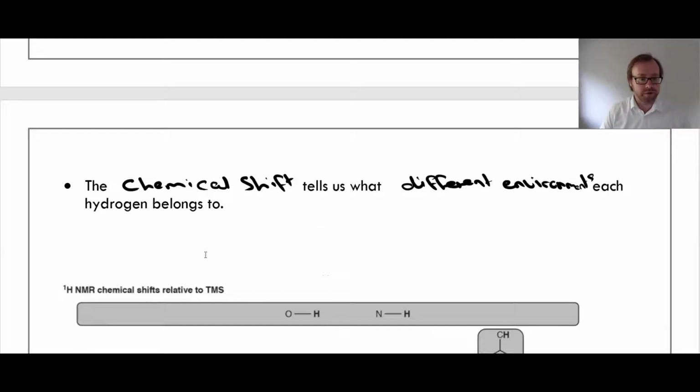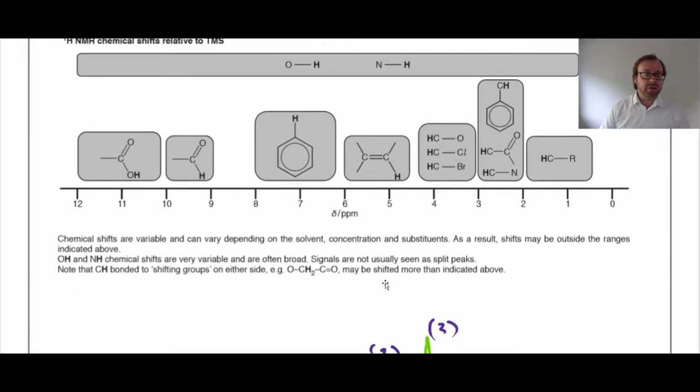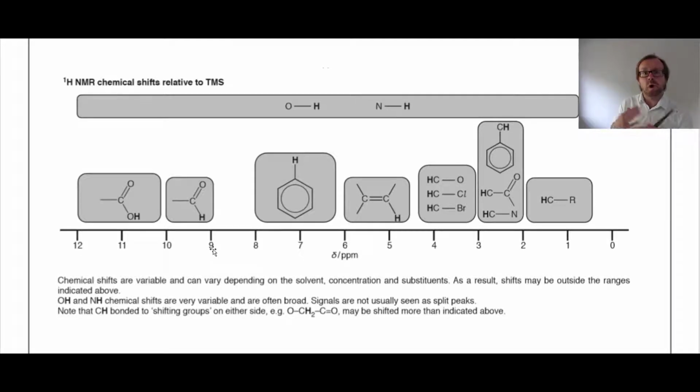I've just scanned this. This is one type of chemical shift data that you will see about proton NMR. It may be in different forms, but it gives basically the same information. We've got our parts per million down here, and here are different hydrogen groups, and depending on what they are attached to, they will shift. This is explained in more detail in another video, so if you're unsure about chemical shift, watch that.